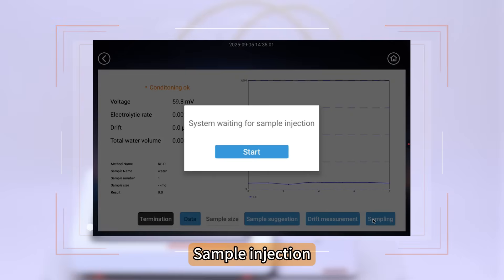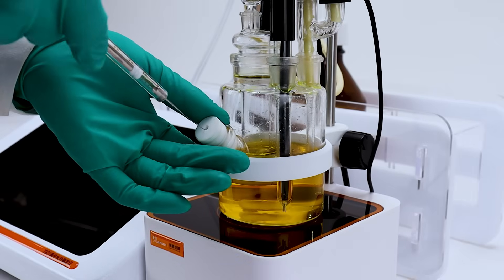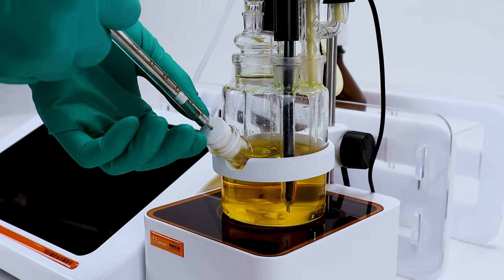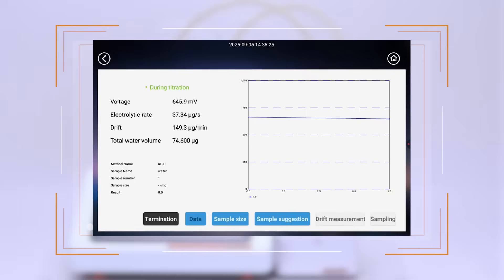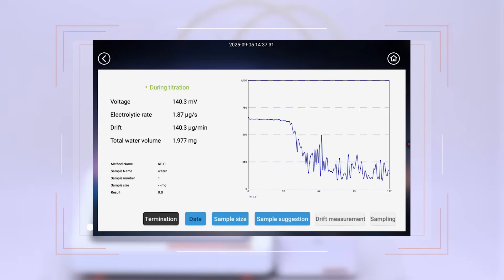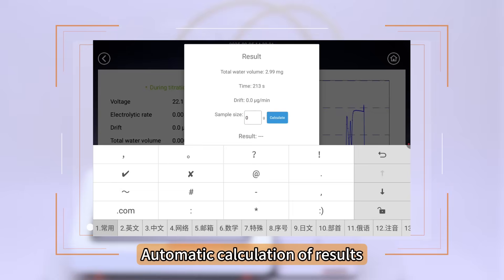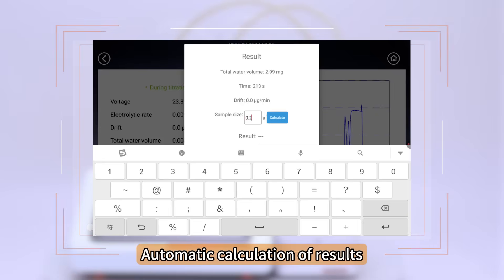Sample Injection. Start Testing. Automatic Calculation of Results.